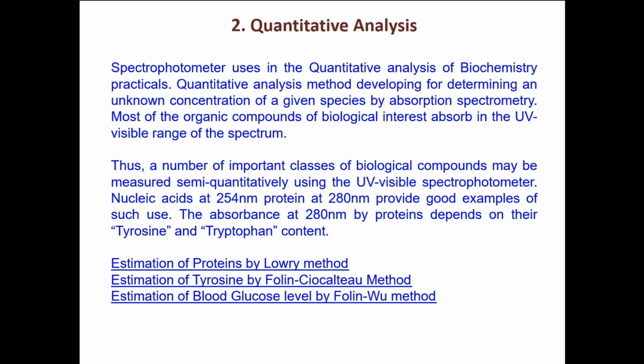When a reaction has such a kind of molecule, we can characterize it. But if I have a reaction with substrate molecules and product molecules, and none of them shows any characteristic absorption at the UV or visible region, then what do I have to do? Do you understand what I mean?